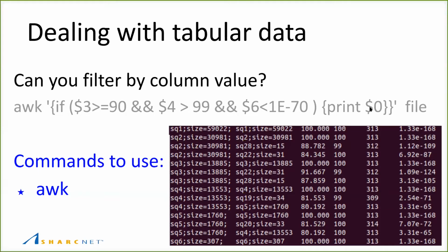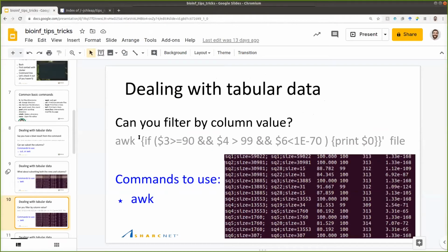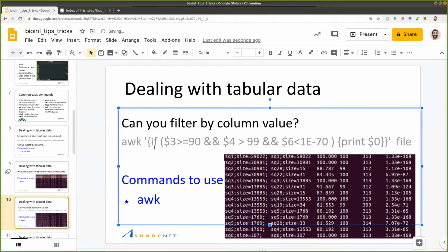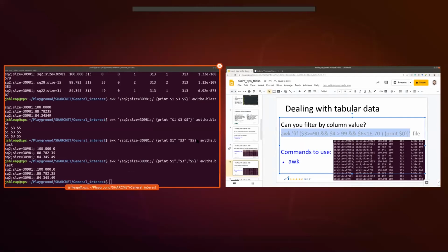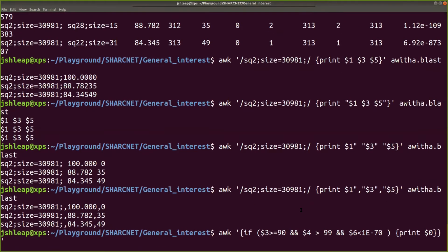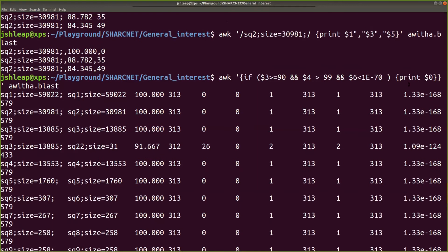So as you saw, I normally use $1 for each field. If I use $0, it's going to print the entire line. Okay, so I'm going to, because I'm a little bit lazy, just copy and paste this into our thing. And the file is with a plus. And then we printed only the ones that follow this particular condition. So let's see, 1, 2, 3, 4, 5, 6, 7.